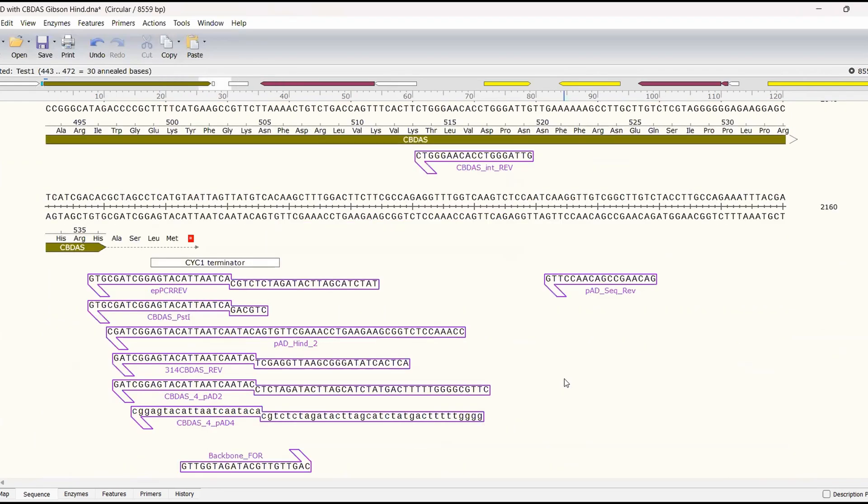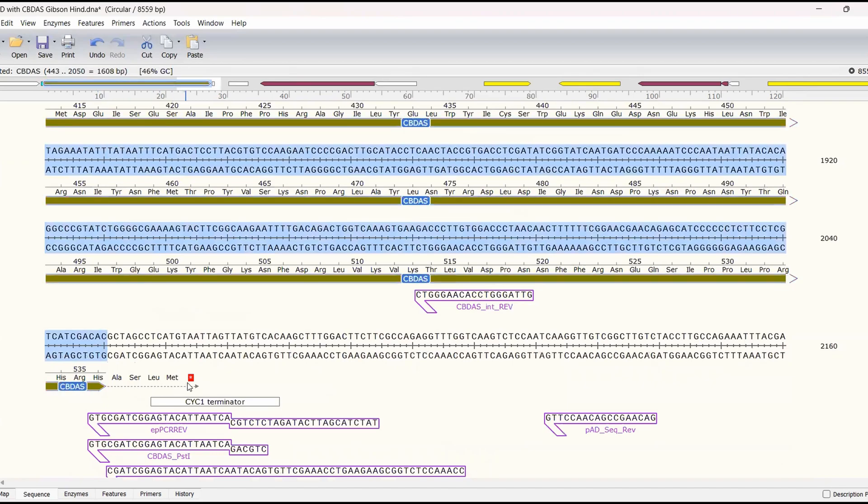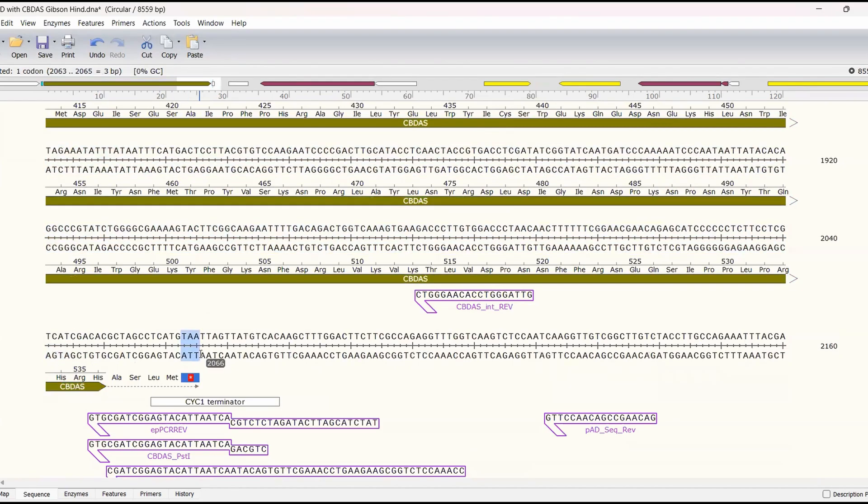And this isn't quite annotated right because the stop codon is here and the stop codon ends in a T. So now we're looking at the bottom strand because we're going to be designing a reverse primer. So we're going to walk this out to about 57, we'll get to 56 so this primer it looks like it's going to be a lot better.